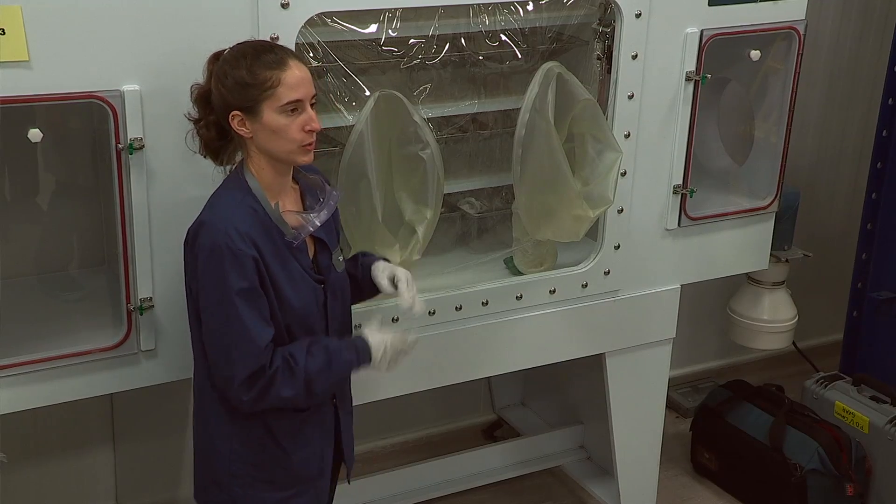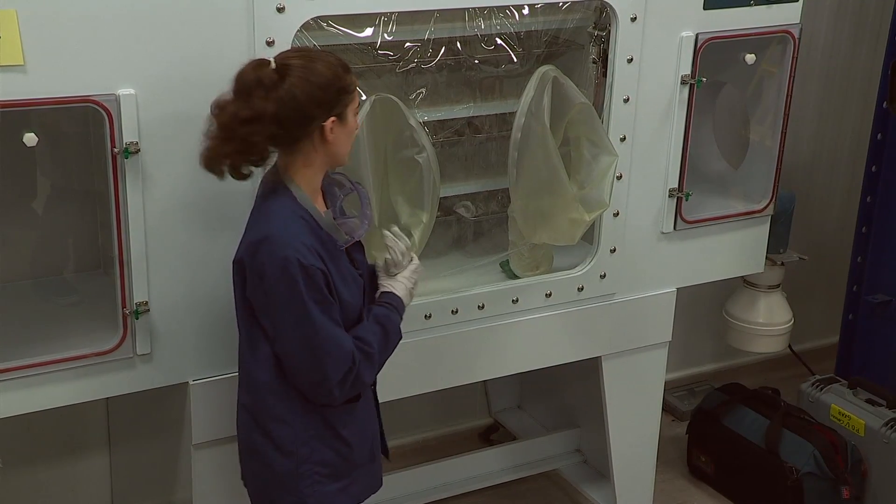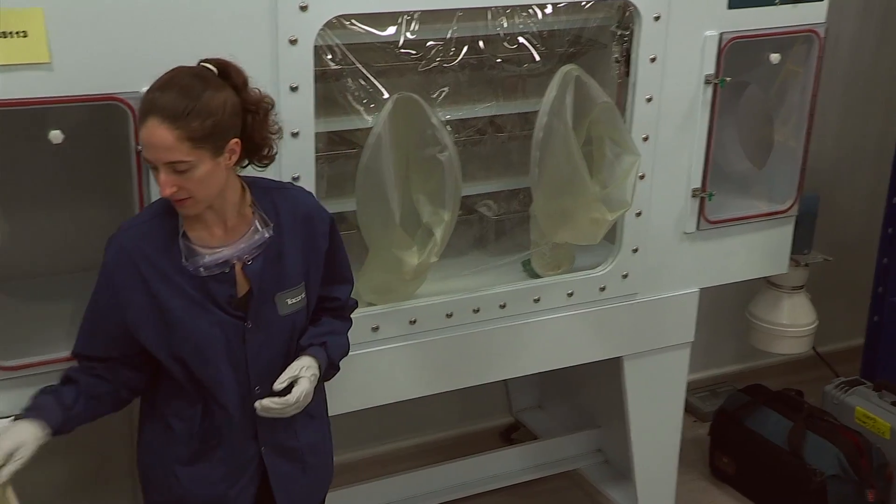If we were going to use water bottles, we would put the bottles in the isolator before it was sterilized, and any of the basic startup supplies.